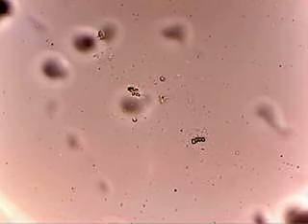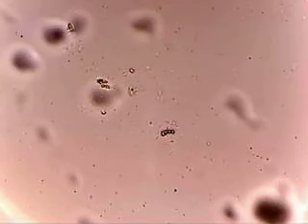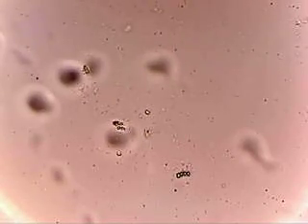There's actually a clearer instance of colonization in concert, symbiotic relationship. Let me get tighter in on that, and I'll prove my case. Gas relationship is what I'm thinking. I am thinking that they get something from each other. Namely, I'm thinking that it's probably CO2 and oxygen exchange.